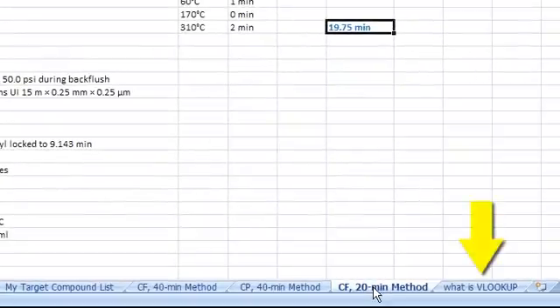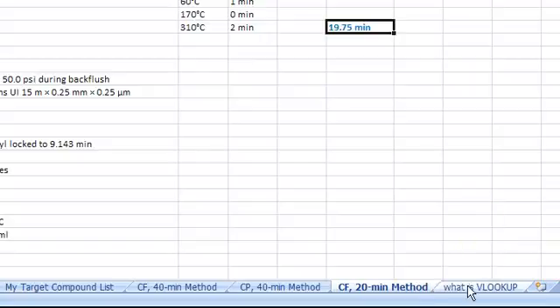The last tab, What is VLOOKUP, shows the Excel function VLOOKUP, which will be discussed in a separate method building video.